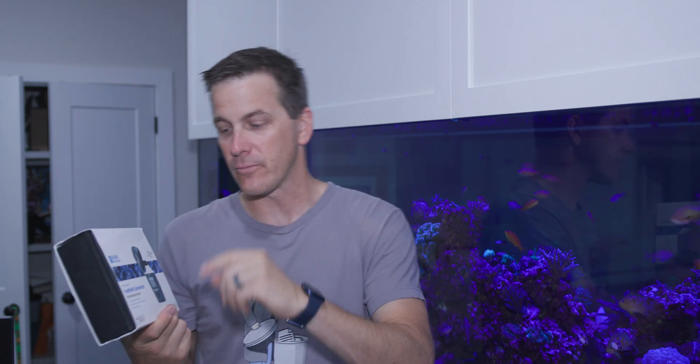Now, the last parting thought at this point with the magnesium checker is, how often am I really going to use this thing? Because how often do most people check magnesium in their tank? Full disclosure, I have a Neptune Systems Trident on my tank, so I don't check magnesium manually. Not everyone wants an automatic checker. Not everyone's going to pay for it. They don't even have a Neptune Systems Trident or other products to find out what the magnesium level automatically is in their tank. So, when I didn't have a Trident, I was checking my magnesium levels once a week. I would use a NIOS kit, which had several steps to it. I like the checkers because it gives me a number readout. I don't have to look at color cards. I don't have to count drops. None of that stuff. Super simple. So, I would have this in my arsenal, especially if you really like HANA products. You've got all the checkers and you want to add this one in. That makes this a no-brainer for me.